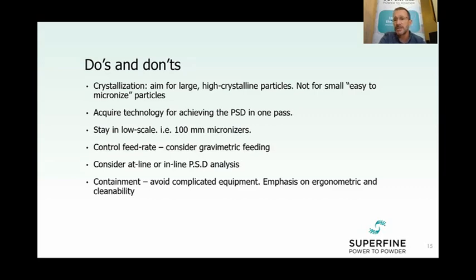If you have a dedicated line just for a respiratory product and it's very big and very important, you may want to consider that. A simpler approach is at-line, which is an automated particle size analyzer on the production floor. It doesn't sit inside the micronizer, but you take a sample every few minutes and put it there. You don't wait for QC results, and then you have real-time results. This is a more reasonable approach.